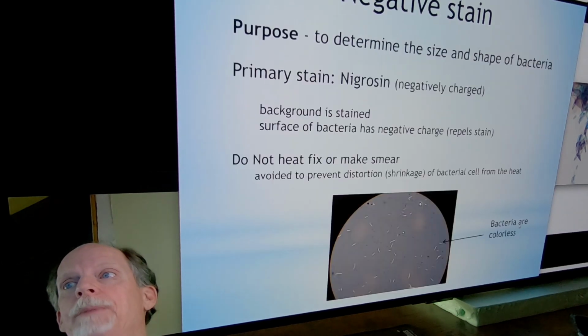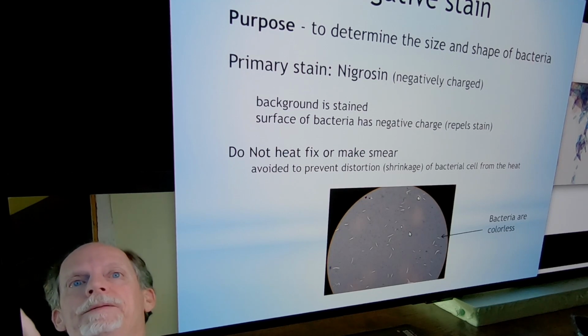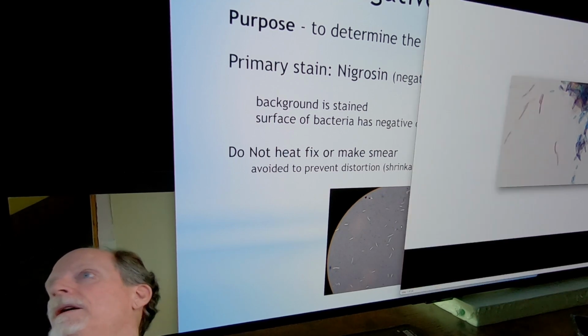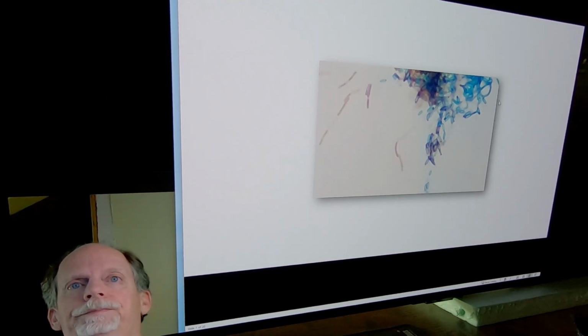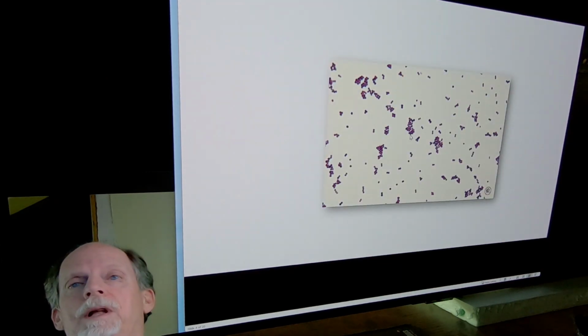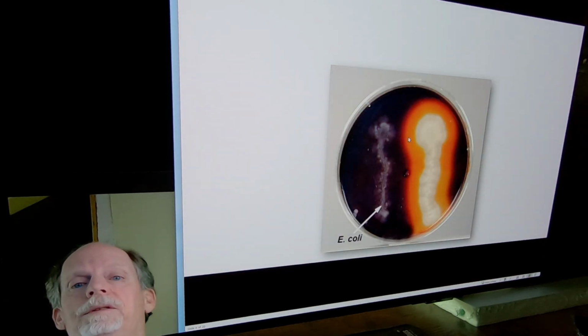When you get to each station, most of them, you'll get an image, say from the PowerPoint, like this one here. If you see this, the first question you probably get asked is, what is the name of this stain? You need to tell me. What I did with these PowerPoint figures is that this is unlabeled, so you can go through this and test yourself. What stain is this, in case this picture is used? What's the name of this test?